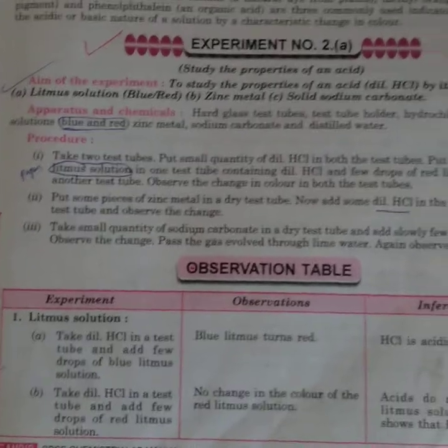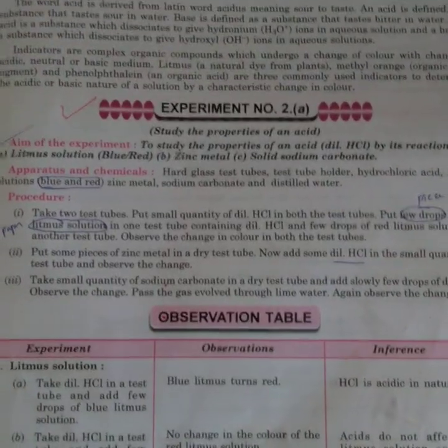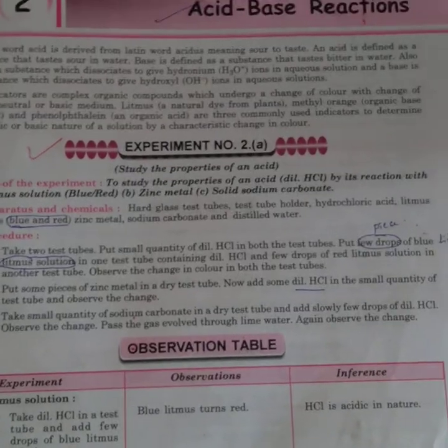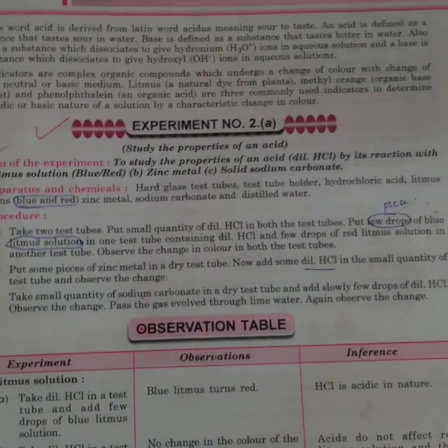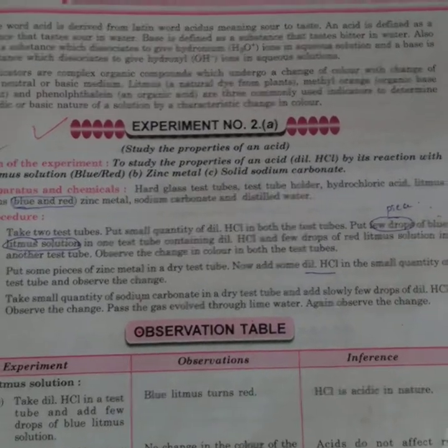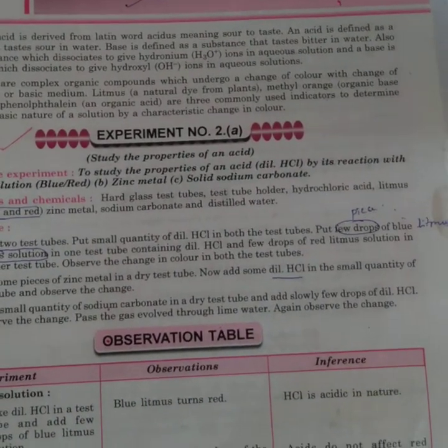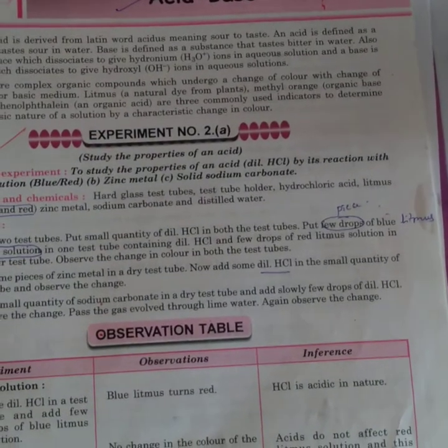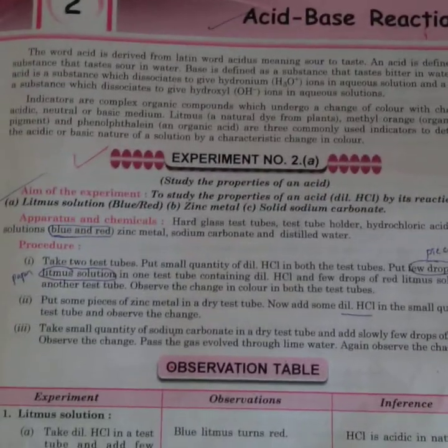That is the observation table. First one, litmus solution. Here we have litmus solution and litmus paper also. Let us take litmus paper. This is blue litmus paper. Even you can take a litmus solution, it is the same. You can take a blue litmus.